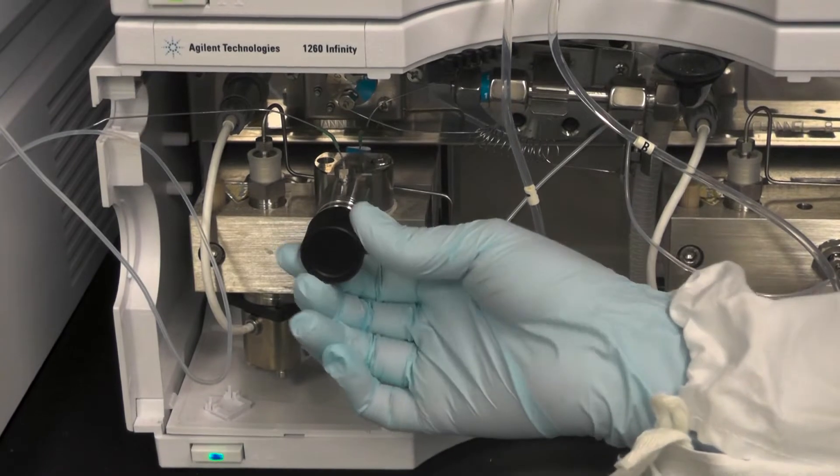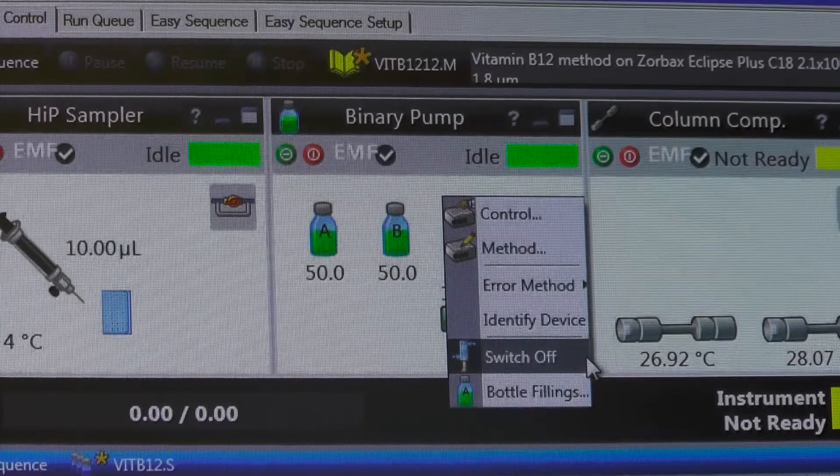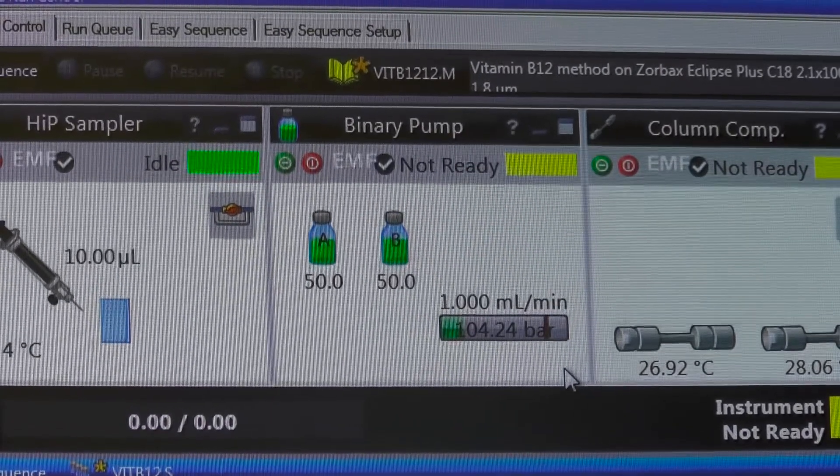When the purging is complete, gently close the purge valve and switch off the binary pump. The initial purge should be done once per day.